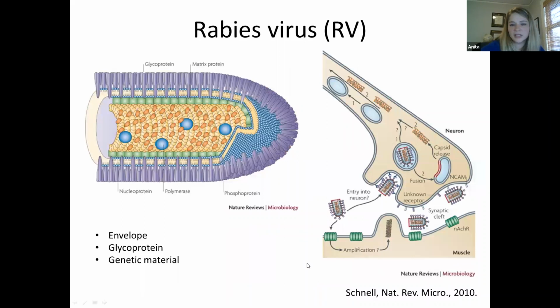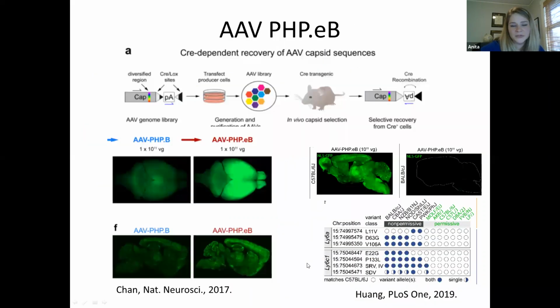Does anybody have any questions about AAVs before we move to rabies? Could I make one comment about AAV, which is just to address a really common misconception that people have? Yes. And that's about titers and titering.